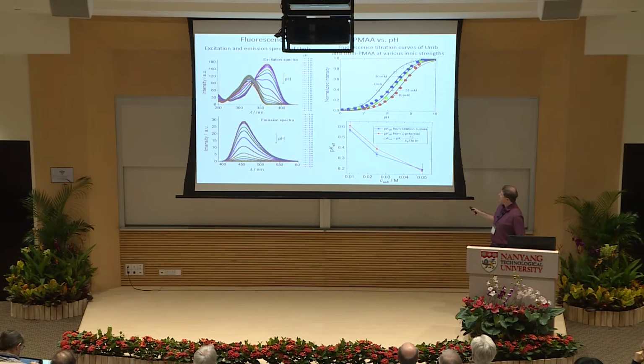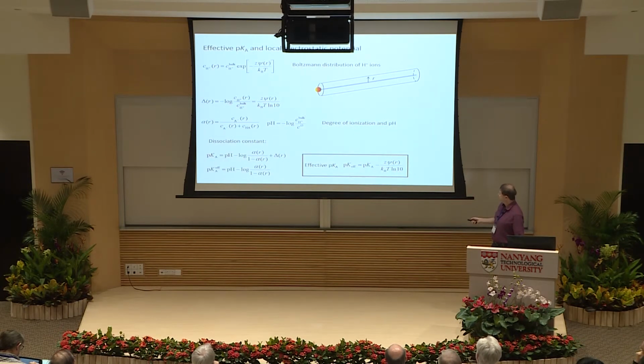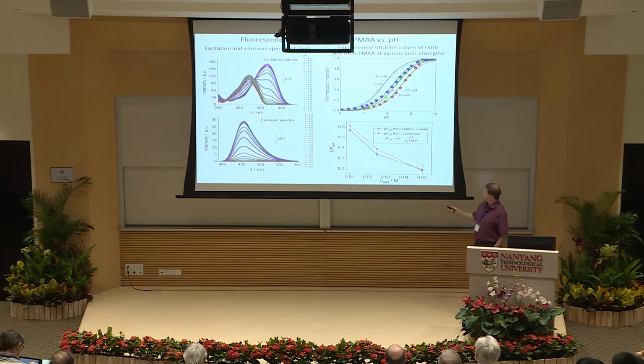What is interesting is that if we measure zeta potential by means of electrophoretic light scattering, calculate the zeta potential using the Smoluchowski approximation, and put it into this equation, we achieve results which are in very good correspondence with the results from the fluorescence measurement. This is interesting because there is no particular reason, or at least we don't have an explanation, why the match is so good for the zeta potential, which is taken from electrophoretic light scattering measurement.